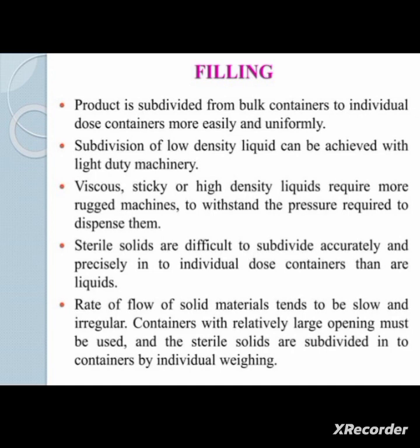Sterile solids are more difficult than liquids to subdivide accurately and precisely into individual dose containers. The rate of flow of solid materials tends to be slow and irregular. Containers with relatively large openings must be used, and the sterile solids are subdivided into the containers by individual weighing.